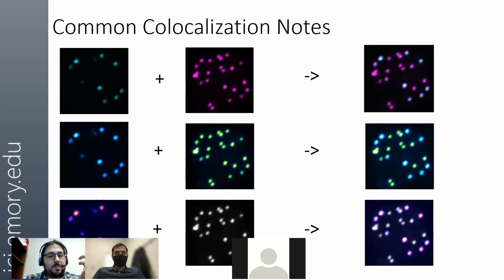Not all of them clearly indicate, to me at least, which sets are overlapping with others, and what that means in terms of relative brightness, how strong the correlation is, how strong the co-localization is just from that.